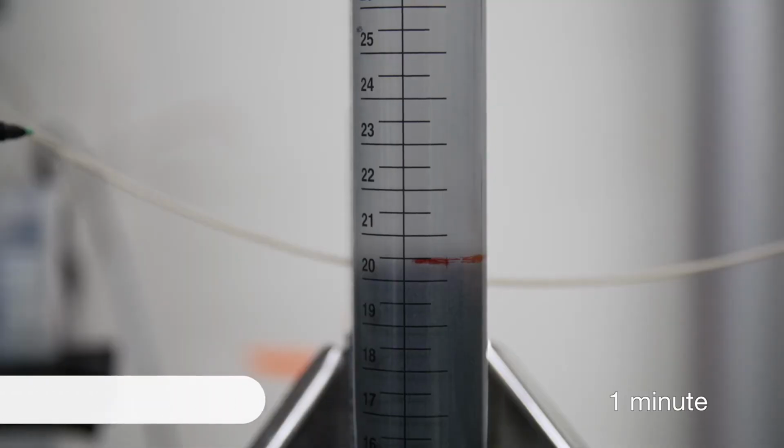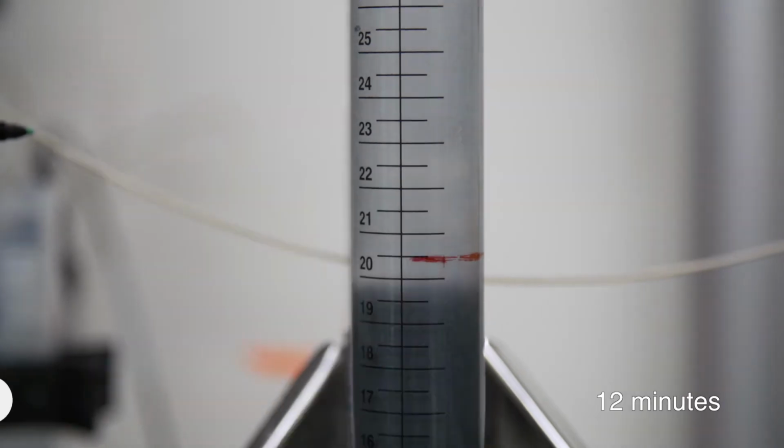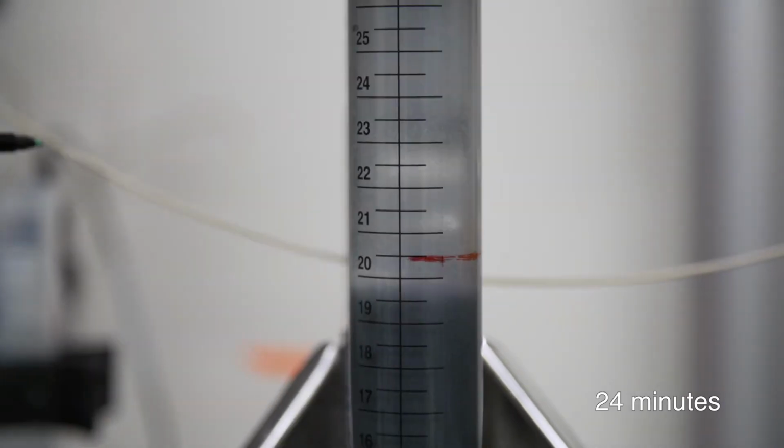The weakly bound materials, such as residual cells, cell debris, and other particulate materials, are washed out from the expanded bed using a wash buffer.